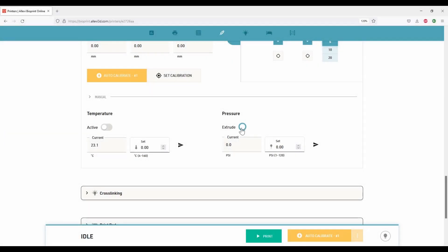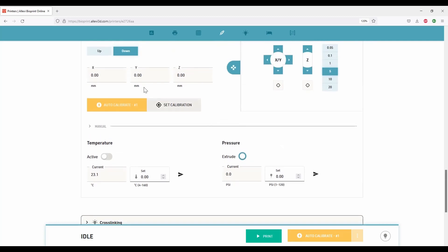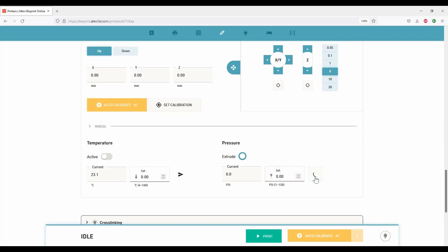Set the pressure. After calibration, to optimize extrusion pressure, move the extruder position to up and enter the pressure value in the set box. Click the green icon to set the pressure. Once the set pressure is same as the current value, we can extrude the ink by pressing the extrude icon.